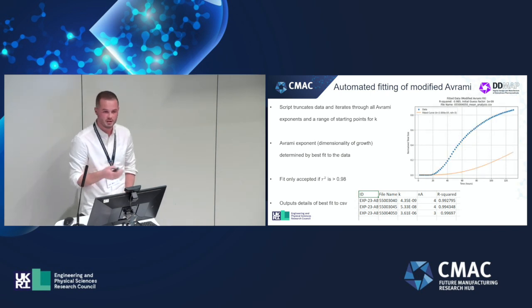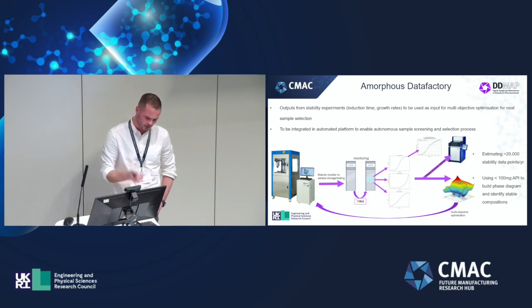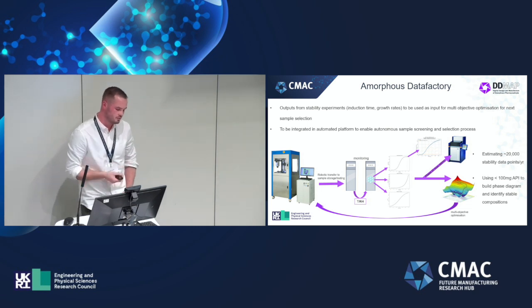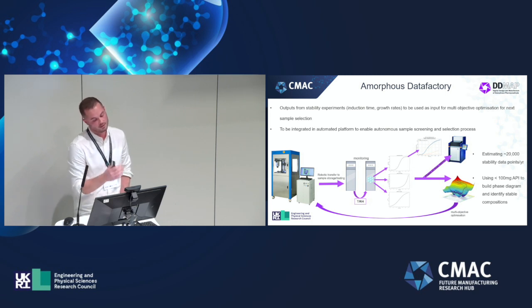It's all accessible for us and can go into the database as that's developed. And so that's just some of the pre-work involved in the automated workflow that we're trying to set up. So as I say, the Chemspeed that I touched on earlier is dispensing out samples, which are then put into a storage oven, monitored with time, fitted, extracting growth rates from that, and then passed on to get phase ID from XRPD.